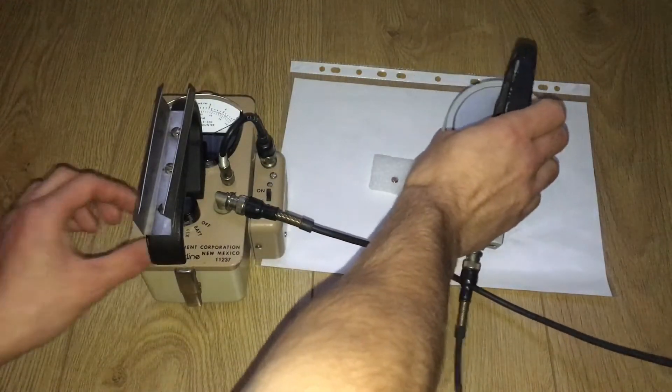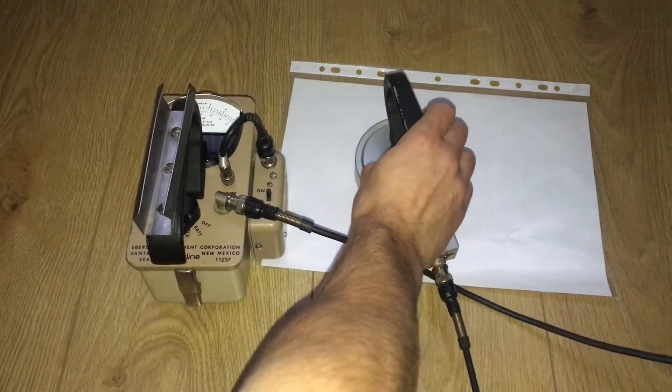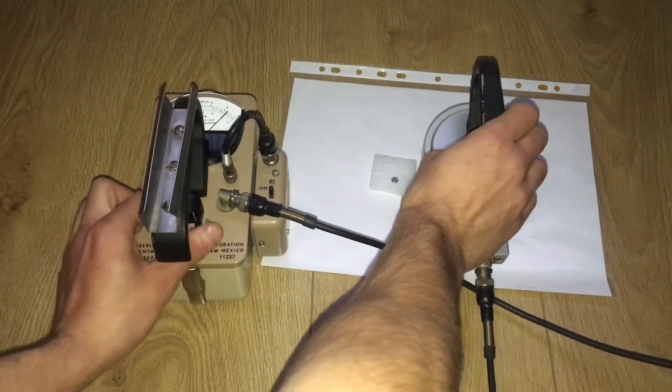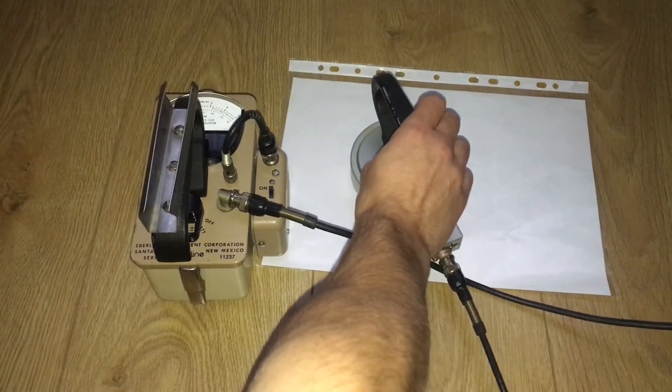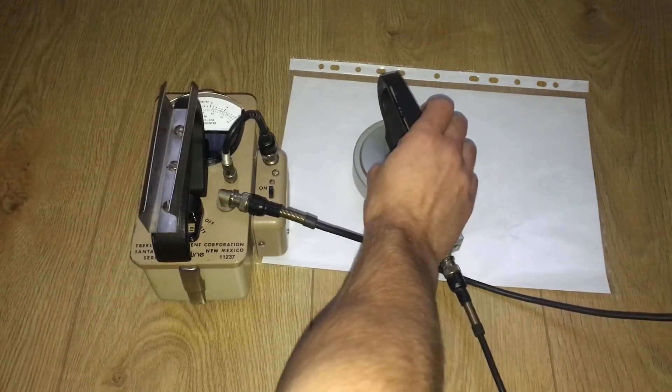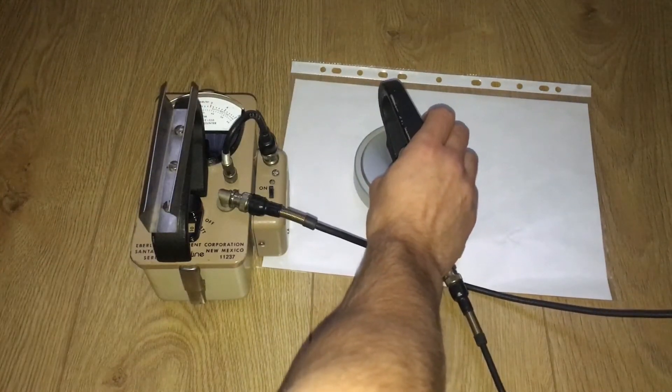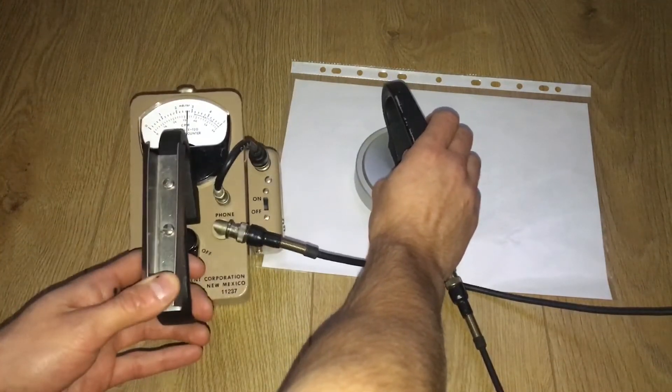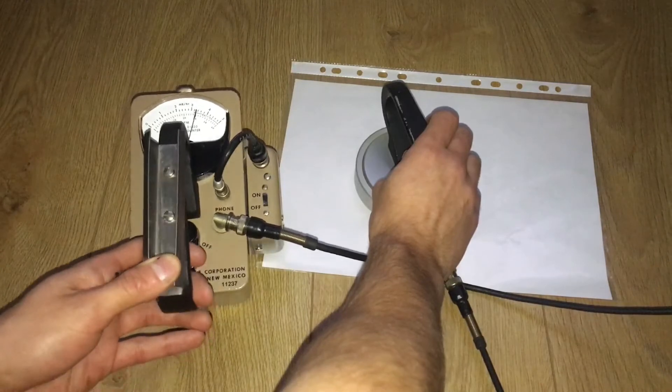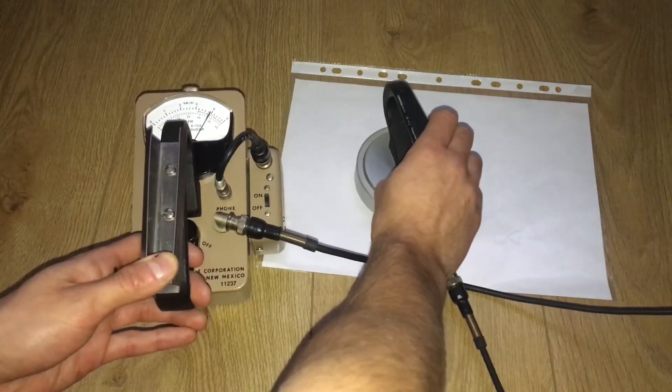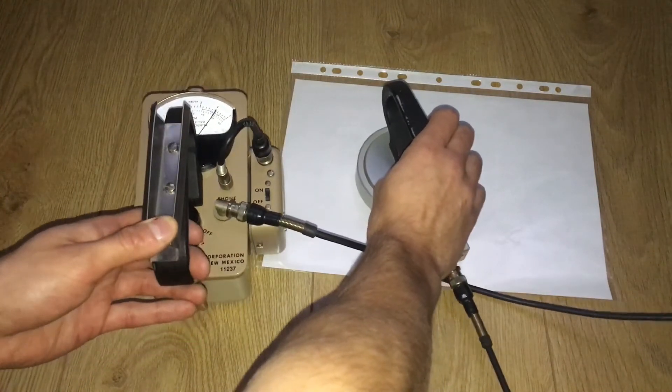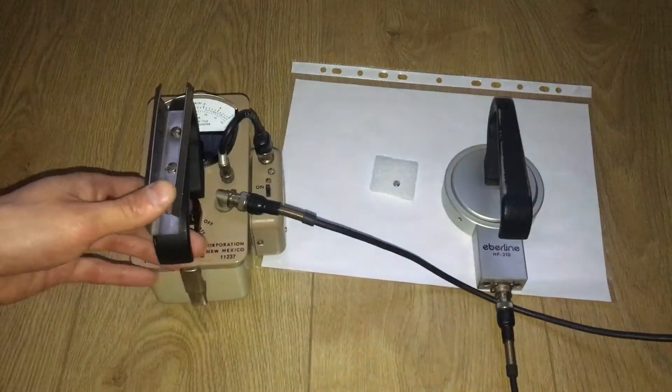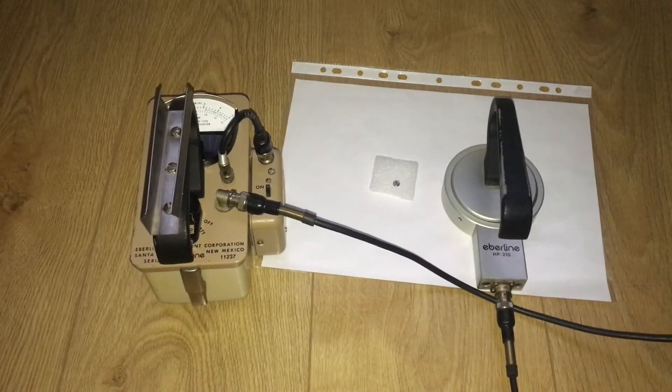Off the scale! Times 1 - off the scale! And times 10. That's about 5,000 counts per minute. But watch if I get some paper to block it.